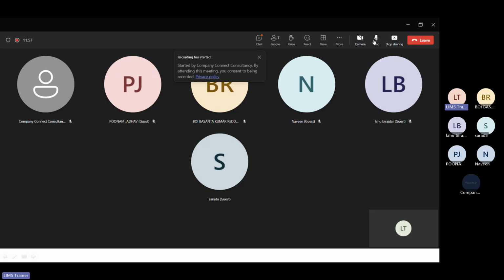So I welcome all of you on behalf of Company Connect Consultancy. This is end-to-end LIMS training. Laboratory information management, and the details will be involved in this course. Let me understand your background.